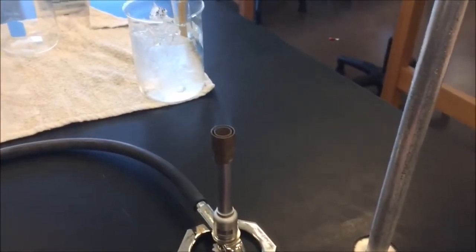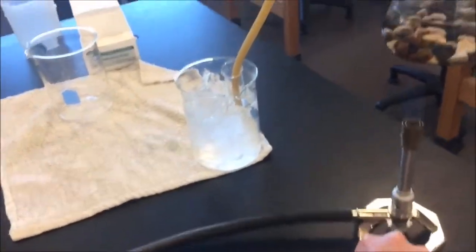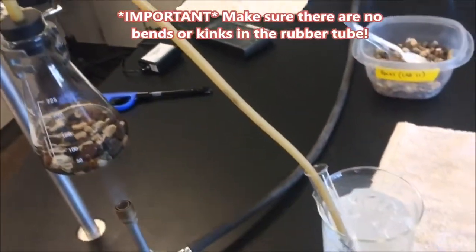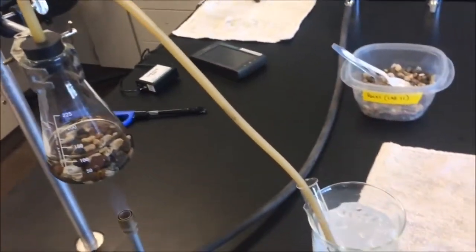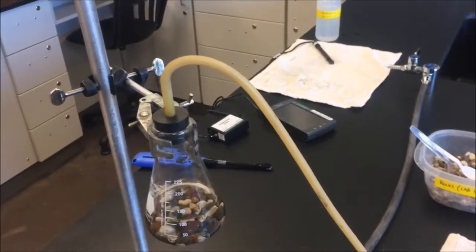Once you're satisfied with your flame, let's move it under the Erlenmeyer flask. Be very careful to make sure that there's no bumps or kinks in your rubber tube. Because that can cause a really bad high pressure situation if that builds up.